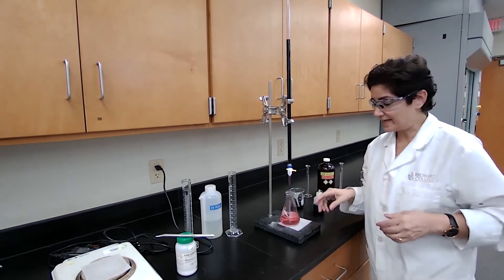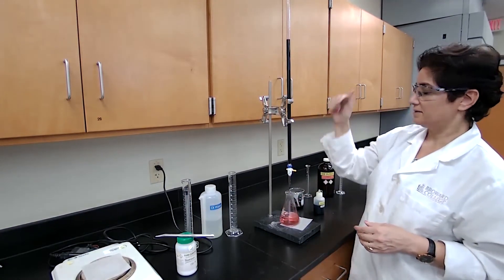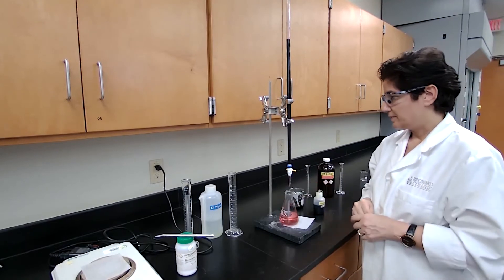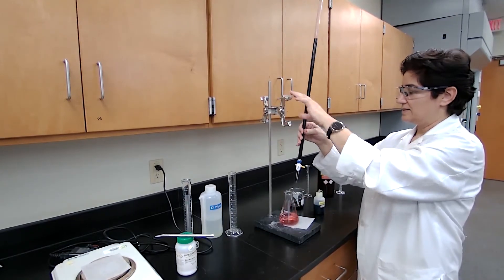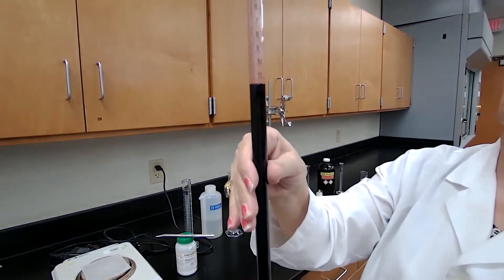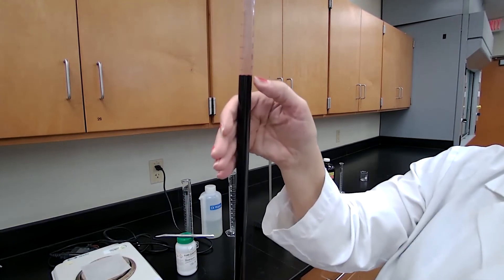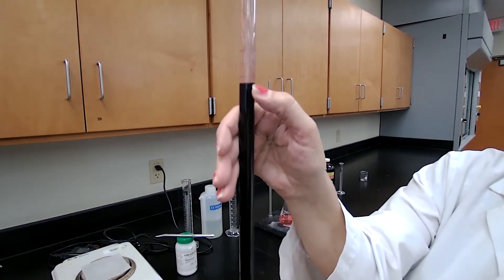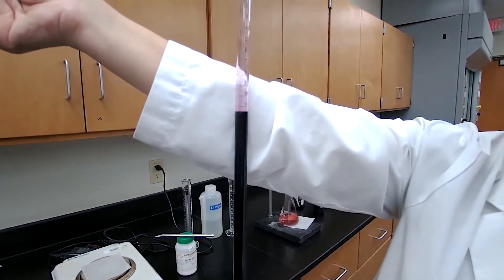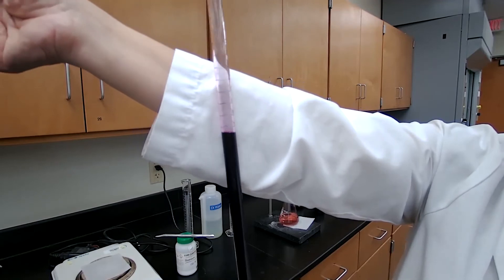If the color stays for 20 seconds, it is the end point of the reaction. I'll bring the buret for you to read. The color is stable and the buret reading is 11.50 mL. Record 11.50 mL as the final buret reading for Part B Trial 1.